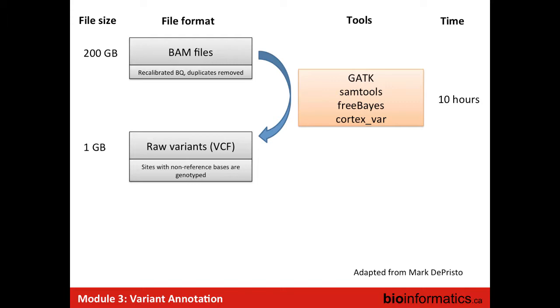These are per patient. This is whole genome sequencing again, but that would be the size per patient. So if you have a big cohort of patients, this adds up to quite a bit. That's why learning how to use clusters like Compute Canada is useful. By the time you get to the VCF, these are files that you can more easily load onto web services, a bit like what you'll do with Mike at the end here.